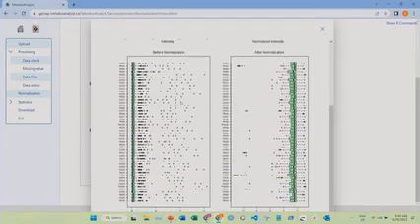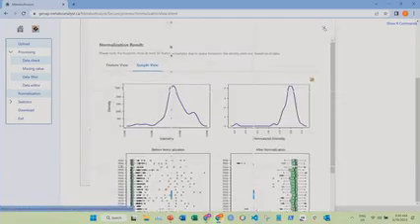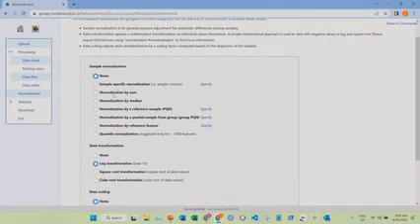Now you can see it's different. There's more of a spread. It's more normally distributed. This might even be a little bit over transforming. Now we almost have a little bit of left skew, but this is not too bad, so I'm going to leave it. You can see each sample level distribution is slightly different across samples, but this is pretty good. I would be comfortable moving forward with this in the analysis. If you saw box plots that were all kind of making a zigzag, really all over the place, then it's really important that you perform one of these sample normalizations.